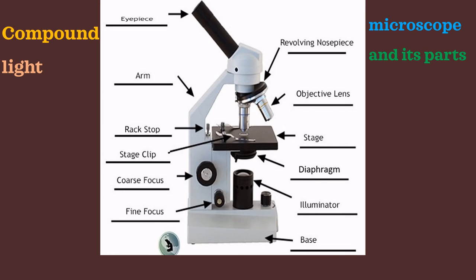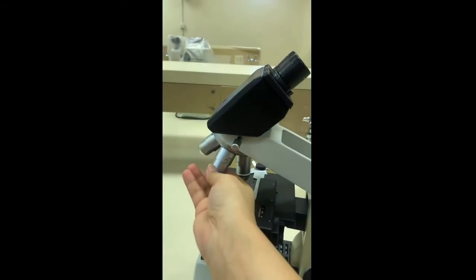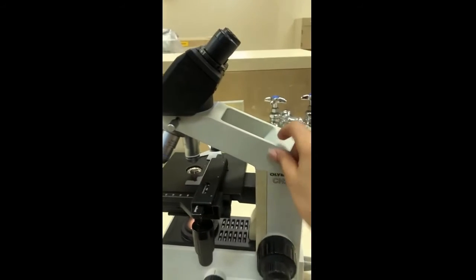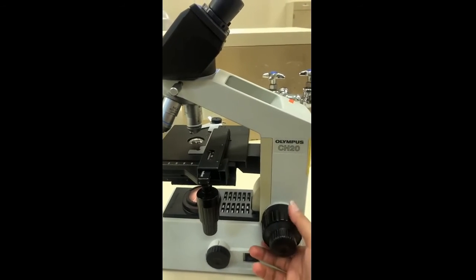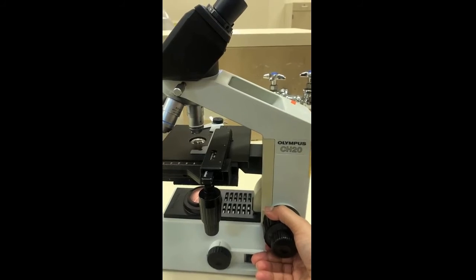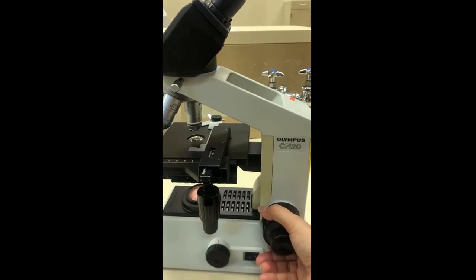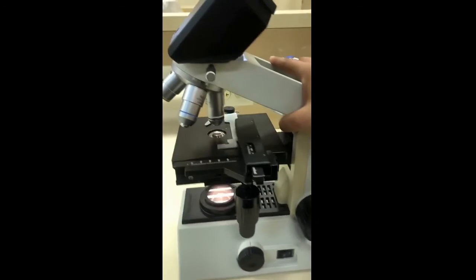Here is the eyepiece lens and the objective lenses. Here is the body tube, the arm, and here is the base. Then here is the light source, the coarse focus, and here is the fine focus, the smaller one. And here are the objective lenses.